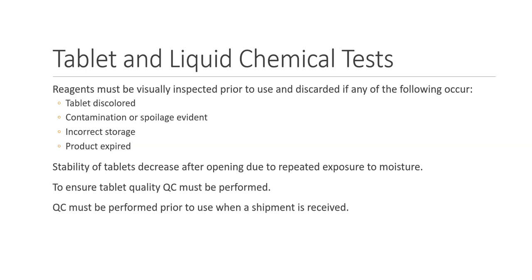You should always rotate the stock so that the chemicals or reagents that are going to expire first are at the front of the refrigerator. Community colleges love big labs because a lot of times staff will stuff things into the refrigerator, push the current lot number to the back, and then it expires and they can't use it. And they donate it to us, which keeps our costs down.